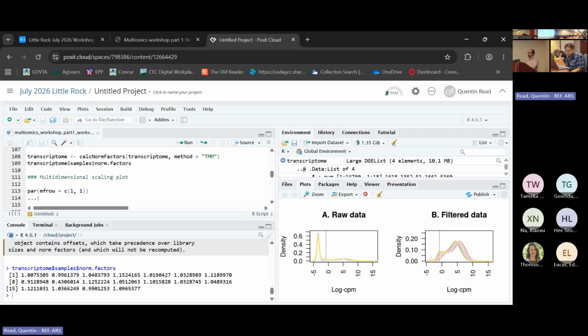Now we can actually look at the data and see if there are patterns between our 3 time points. So before we do any formal statistical analysis of that, like I said in the introductory material, you want to use a really simple method to just look at patterns real quick before we do anything more sophisticated.